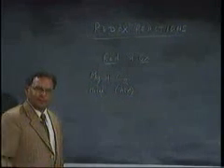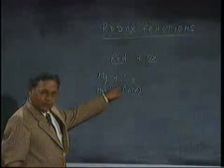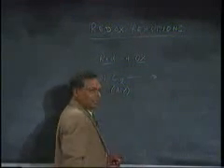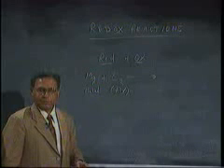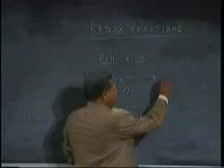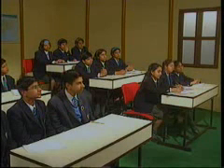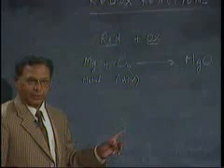We have burned in the presence of air which contains oxygen, and when burning is taking place, you get a white powdered substance which is magnesium oxide. This is magnesium oxide after burning.